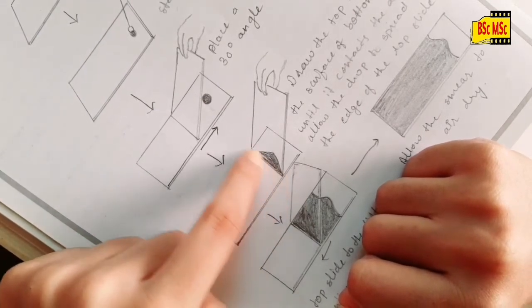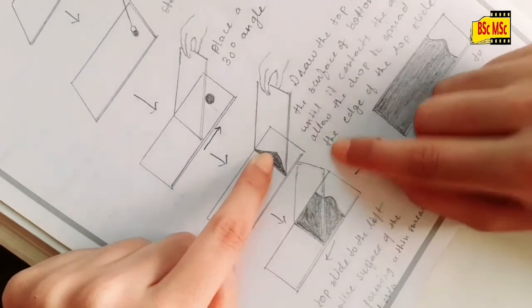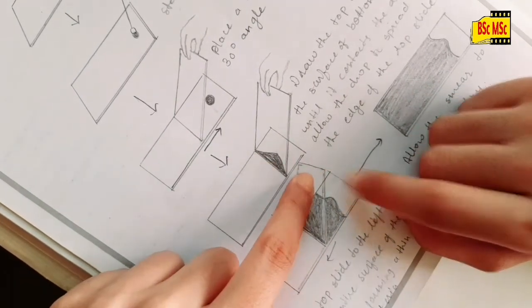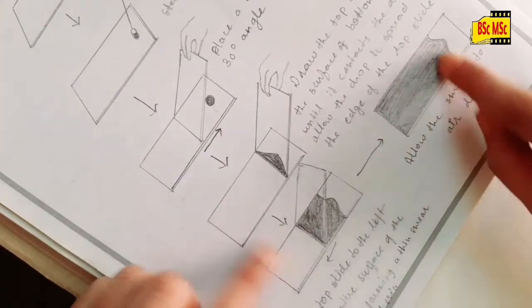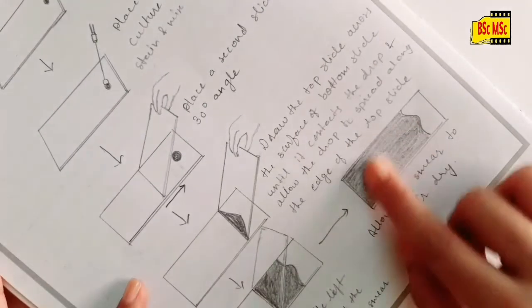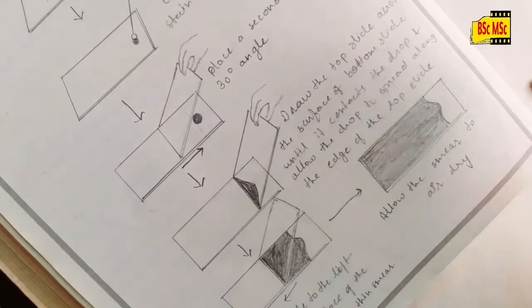Then what you need to do is push this upper slide to the left side and make a thin smear with the stain. After that, allow it to air dry, and then observe under microscope.